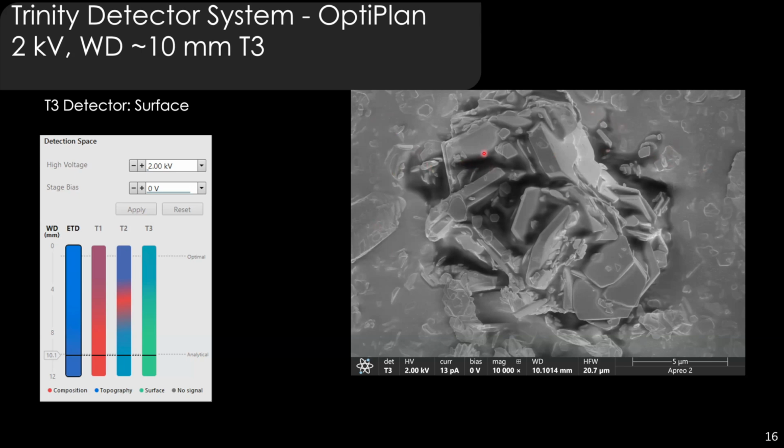But because we're using very low energy secondary electrons, we can see a little bit of charging effects from the organic material that's on the surface. So we can see some lines and some dark halos from charging. You can play around. We could probably use a little more signal, maybe change the kV a bit, see if we can reduce that, maybe even some stage bias for that.